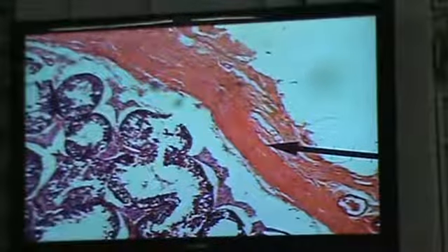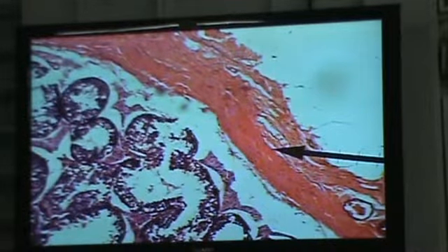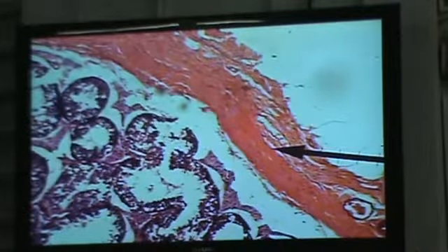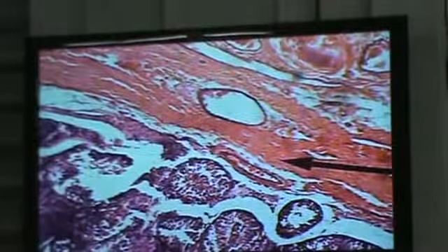So these are the seminiferous tubules, reasonable? So the seminiferous tubules, and when we look outside, we see there is a thick, fibrous covering. And that is formed by collagen. That thick fibrous covering is known as the what? Tunica albuginea. Okay? It's very, very poorly developed on the ovary. Why do you think now, Matthew? Right, because the graafian follicle needs to extrude that egg, so therefore we can't have a thick wall, okay? But the testis now is totally different.